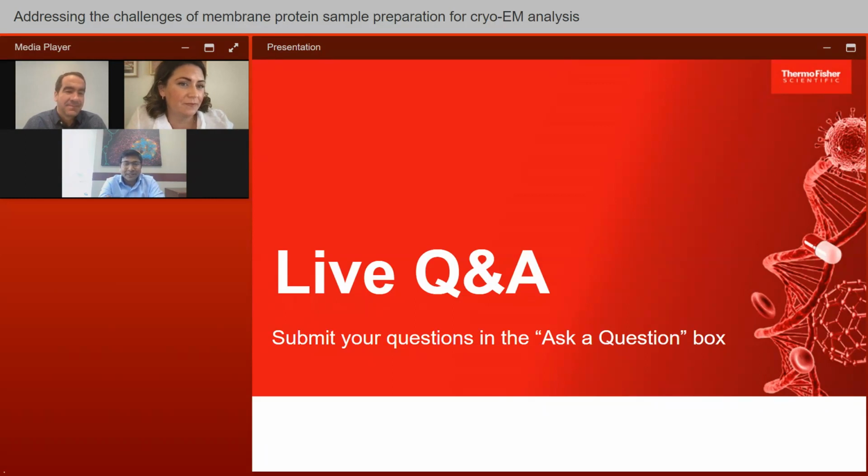That is a great question. And actually, it depends on the protein, but I will answer it differently. The lipids are very important for the membrane protein, and when there is a harsh detergent, that is problematic. But also, if you want to extract nicely from the native tissue source or from the cell, you sometimes might want to use the harsh detergent to do the extraction better.